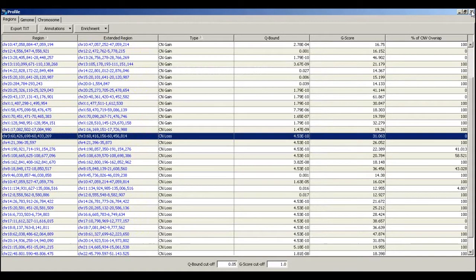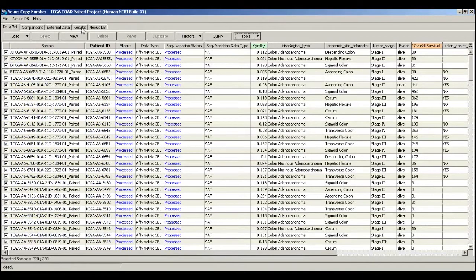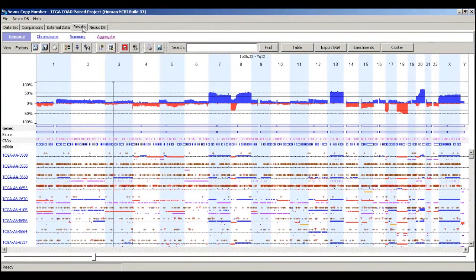Okay, so now that we've perused our copy number changes, I'd like to look at some of the results that we have with the mutation data. The first thing I'm really interested in is observing this hypermutability phenotype and seeing if there's anything of interest here. One way to evaluate this is to look at the number of mutations that are called with each sample.